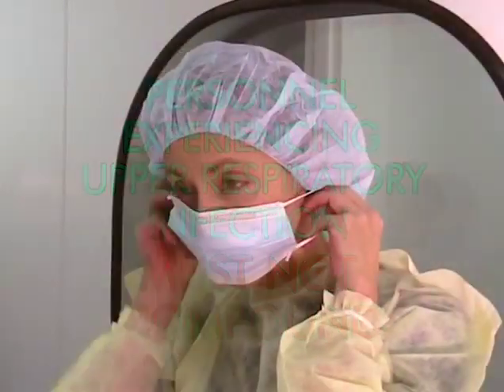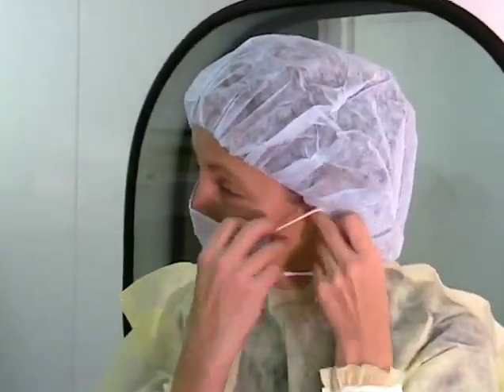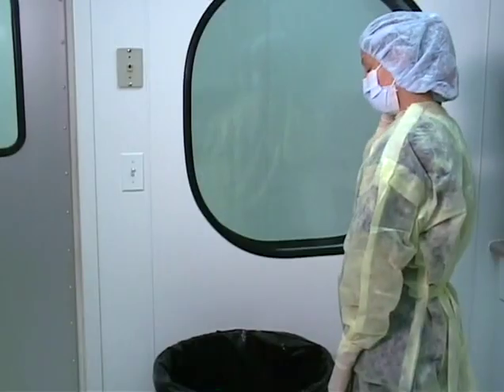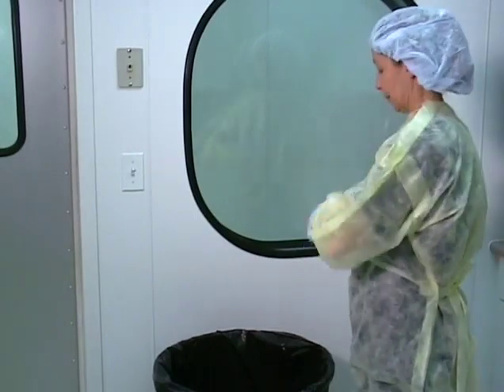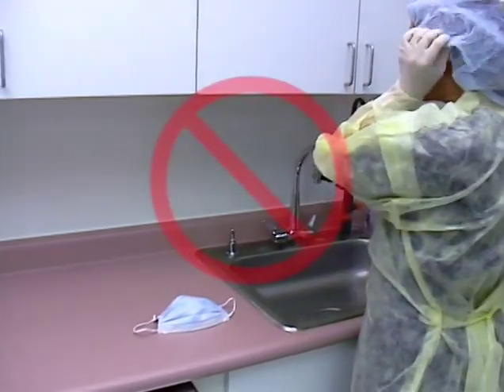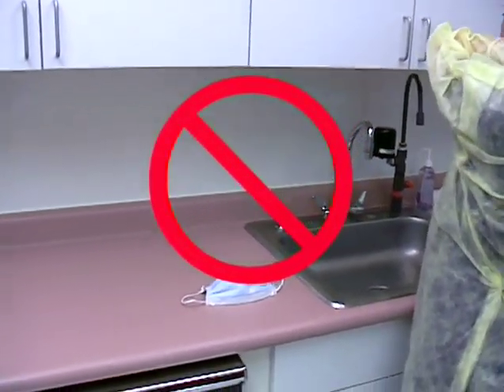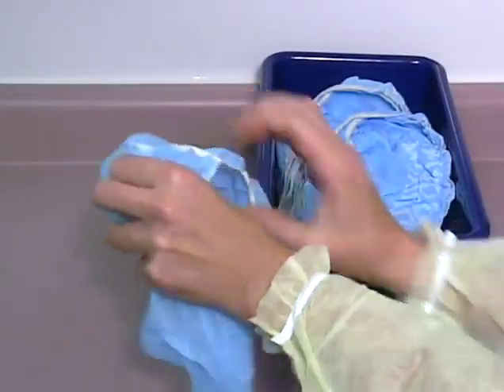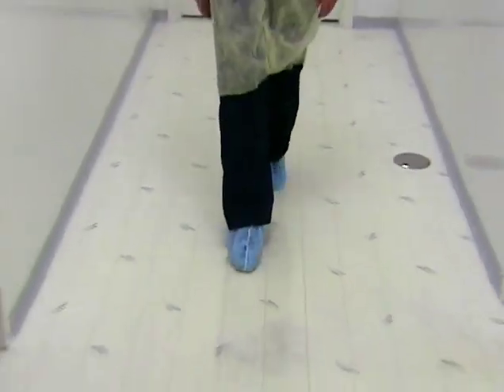The mask should be comfortable and be fitted properly to the wearer's face, using proper snugness and form-fitting nose closure at the bridge of the nose, just beneath the eyes. The mask should be used only once and disposed of immediately following use. It should not be reused or left lying around as a concentrated source of microbiologic contamination. Shoe covers isolate the soles and surfaces of street shoes and prevent the tracking of numerous outside contaminants into the buffer area.